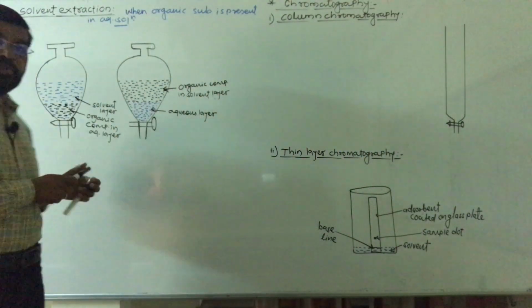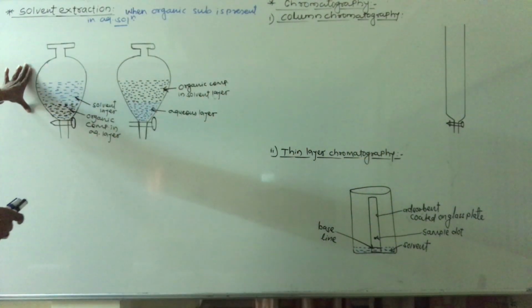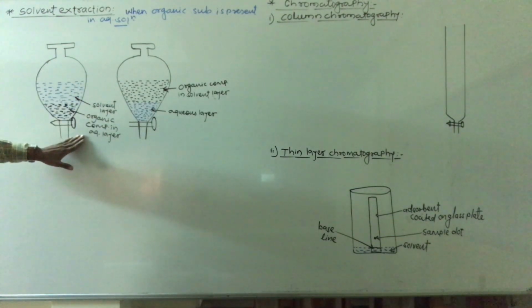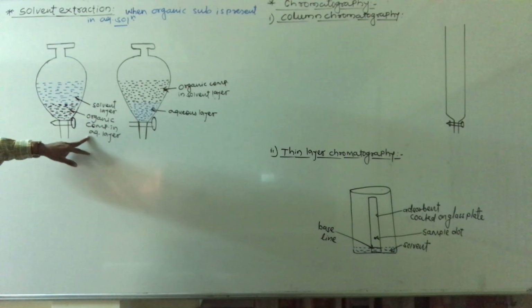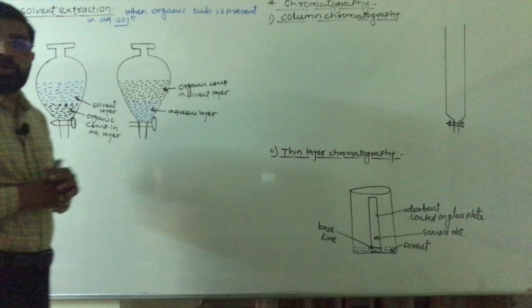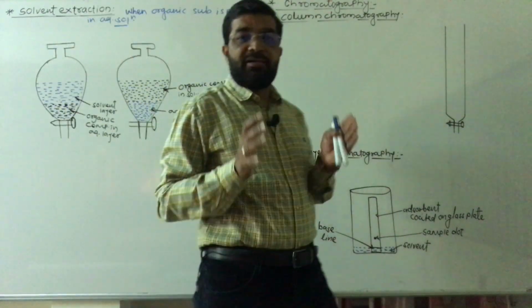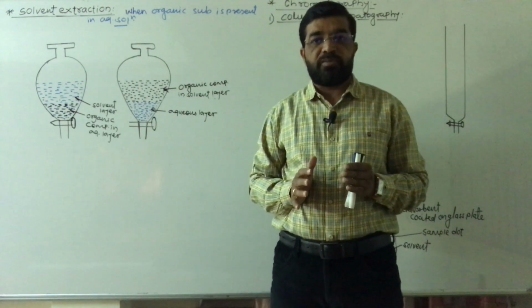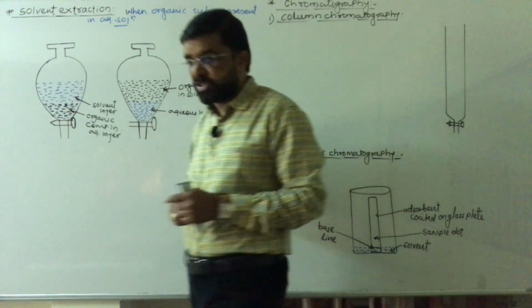Here see, in this funnel I have taken the organic compound in the aqueous layer, and this is the solvent layer. First of all we have to take that substance which is in aqueous solution.